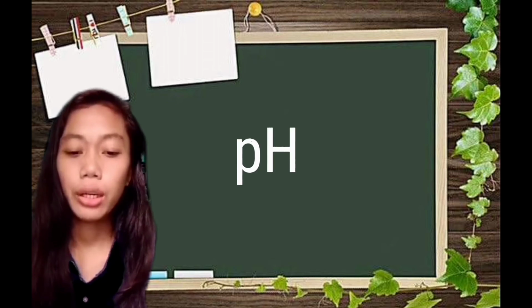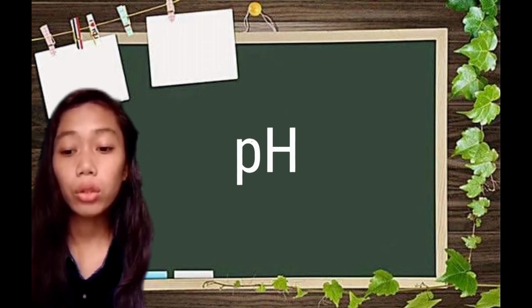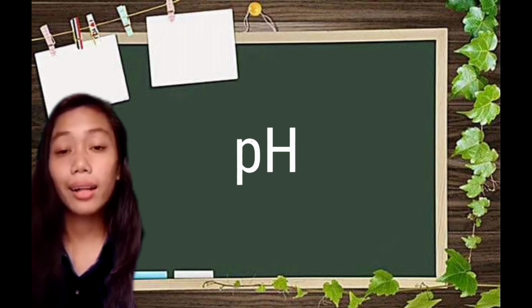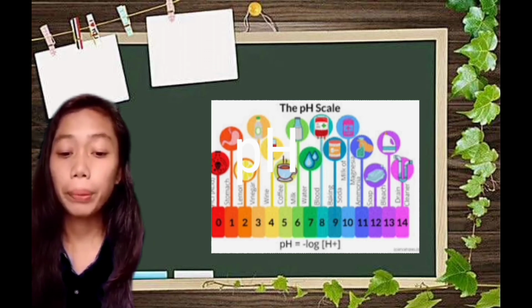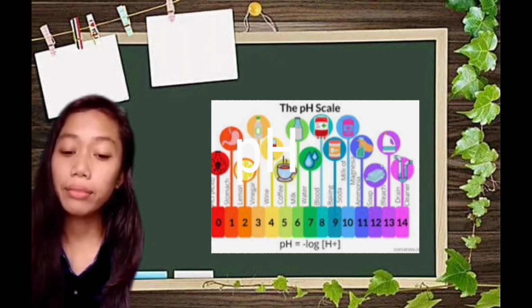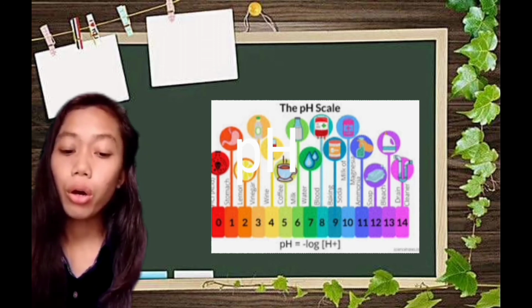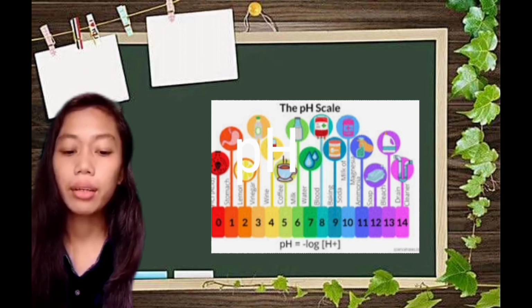The pH. Check the CO2 supply. Is the CO2 cylinder empty? Check the pH of the algal cultures using a pH probe. Is the pH too high, above 8.5? Is the pH too low, below 7.5? Adjust the CO2 supply accordingly.